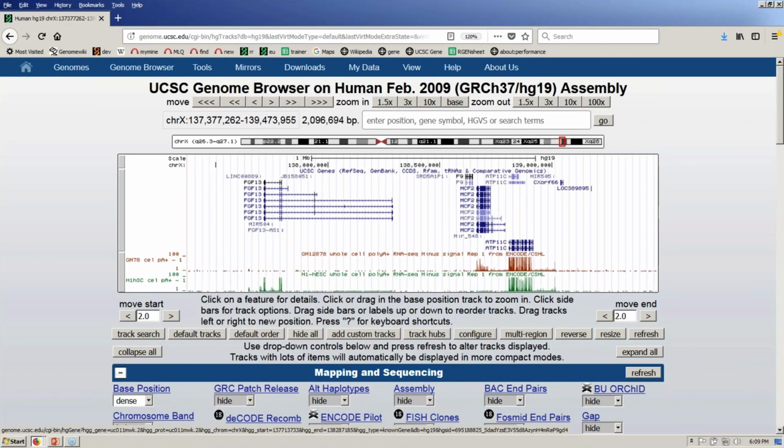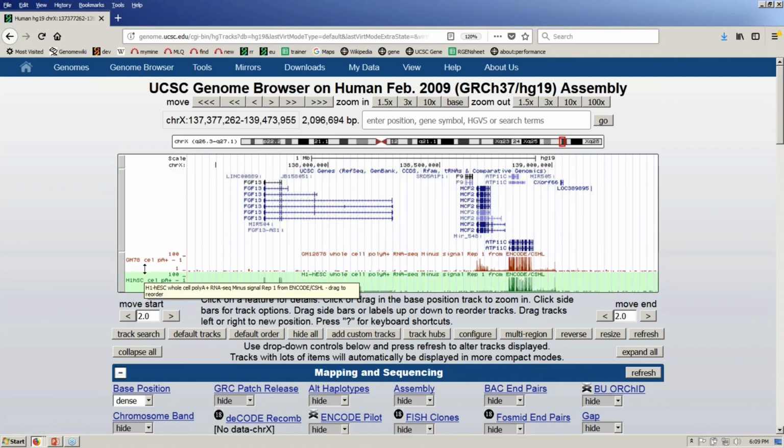we're back to the Genome Browser with just 2 data sets turned on. So you may recognize them as 2 of the 16 we had on before, and I could have turned them off one by one and gotten down to this, but it's much simpler to make the session and load it up for you in one single process.